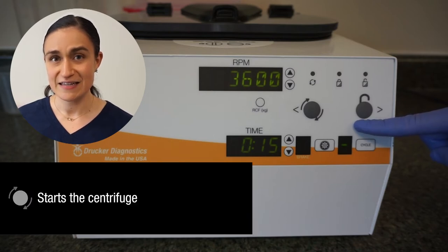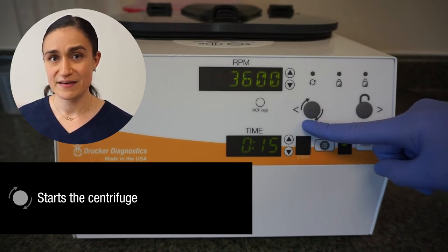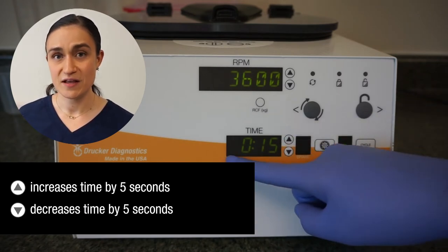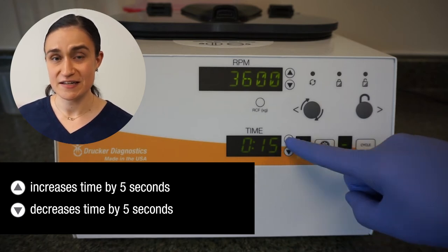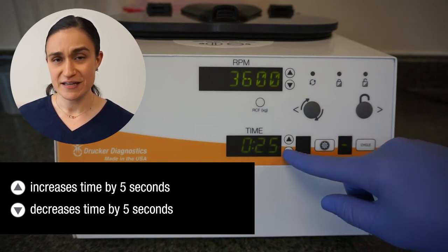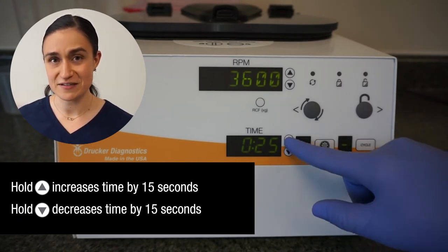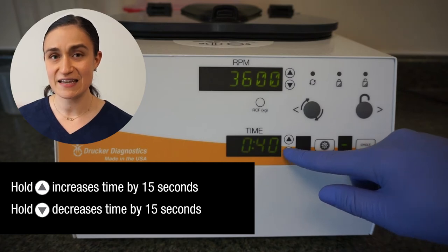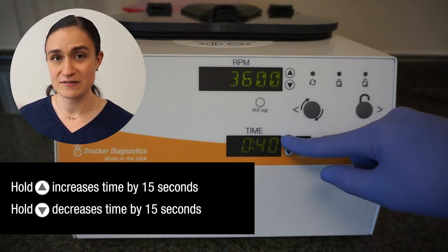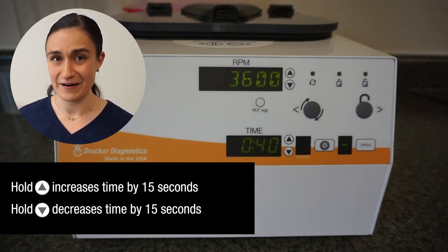The button next to that is the start button — this will start a cycle with your currently selected RPM, time, and brake parameters. The time display screen shows the currently selected time, which can be adjusted using the buttons next to it. A single press will increase or decrease the time by five seconds; press and hold to increase or decrease by 15 seconds. If you overshoot your target time, use the down arrow to decrease, and if you decrease too much, use the up arrow to increase again.